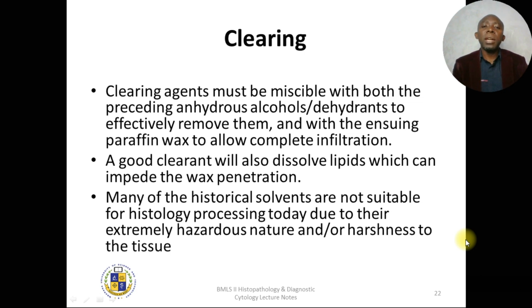So now we need to look at a clearing agent which is miscible with both, and in this case it can remove the dehydrant and make sure that the paraffin wax can be allowed to completely infiltrate the tissue. A good clearant will also dissolve lipids which can impede the wax from penetrating.